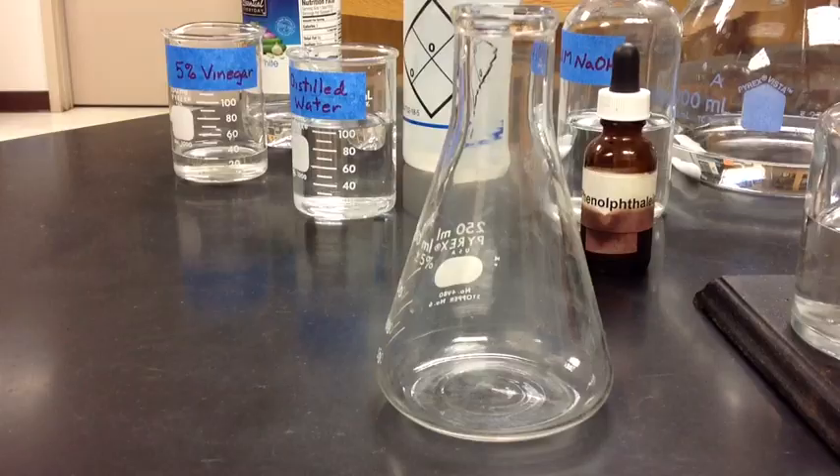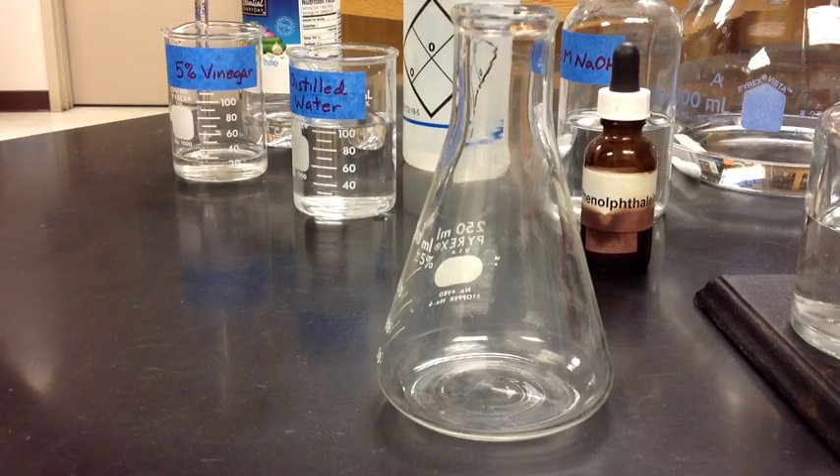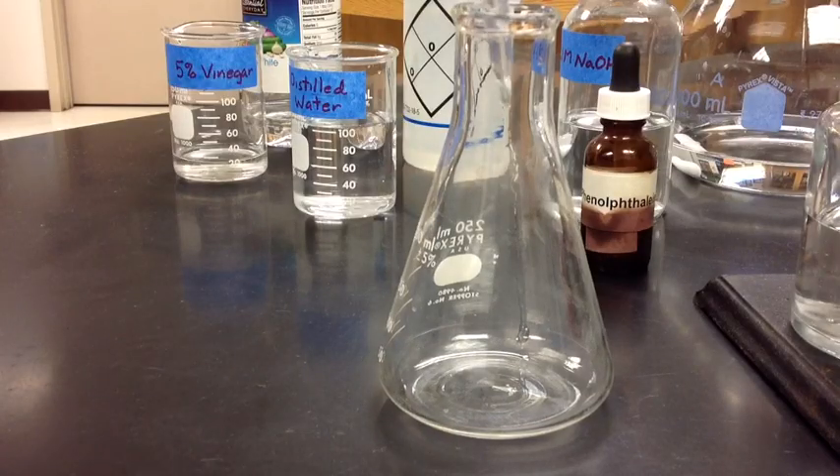I will start by gathering 5 milliliters of my vinegar solution. Using a pipetter, I will drop 5 milliliters of vinegar — right to the 5 milliliter line — and add that to my Erlenmeyer flask.